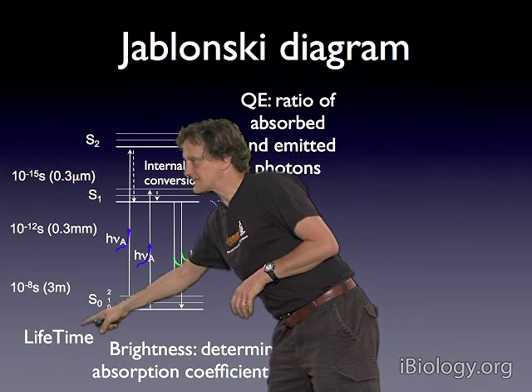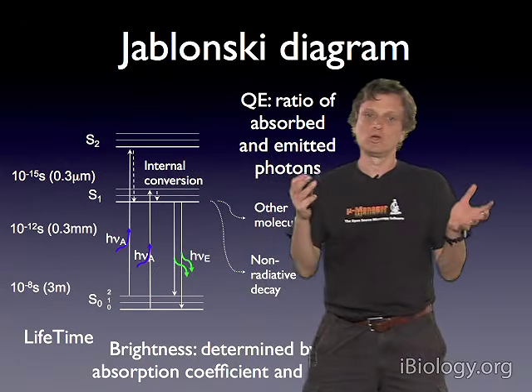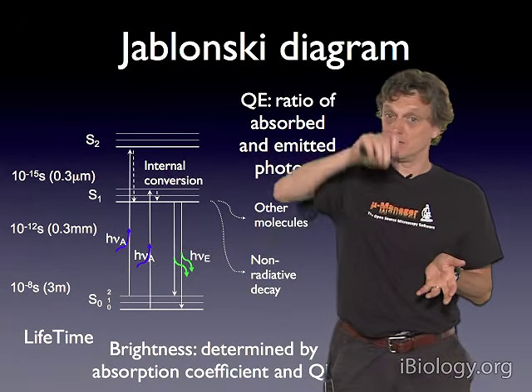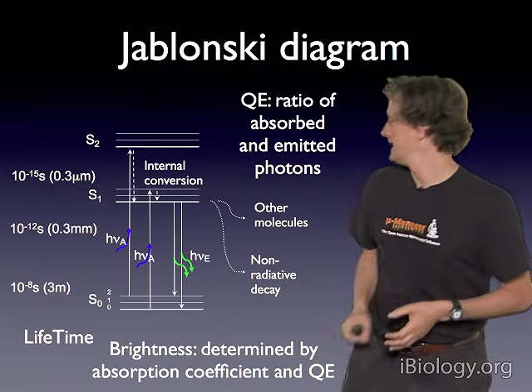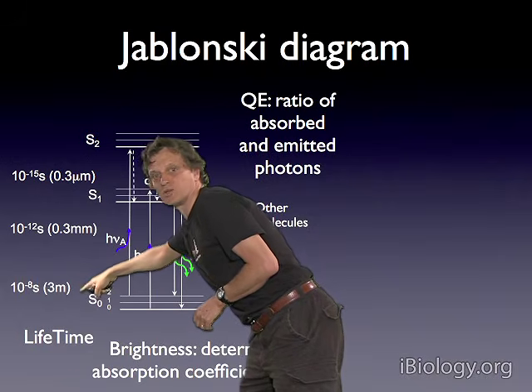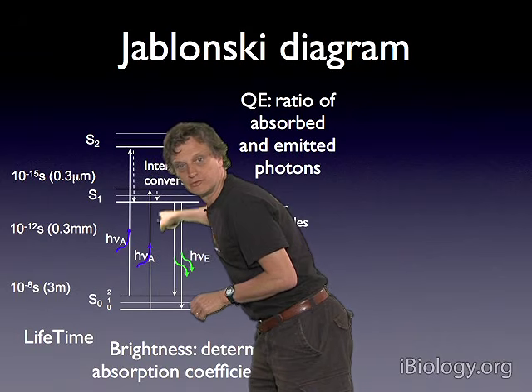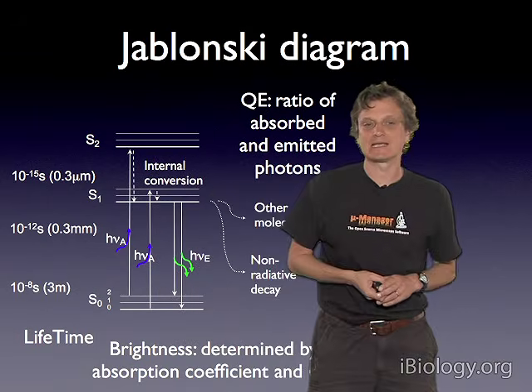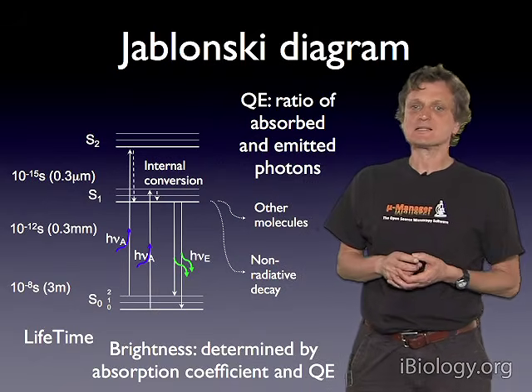Another important aspect is what we already talked about: how long does it take between absorbing light and the dye returning to the ground state? That is what we call the lifetime. It's mainly determined by how long it takes before we return to the ground state out of the excited state. Usually this is on the order of nanoseconds.